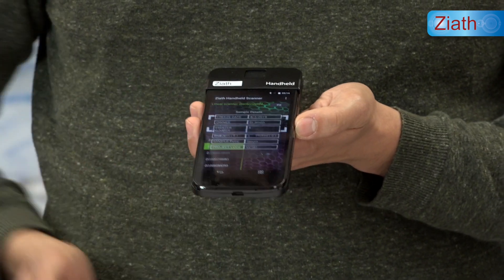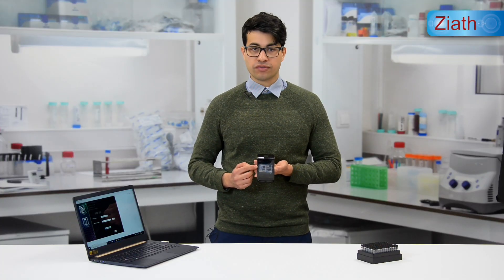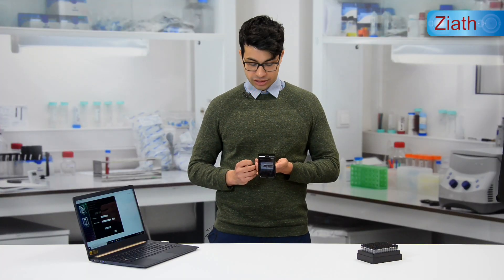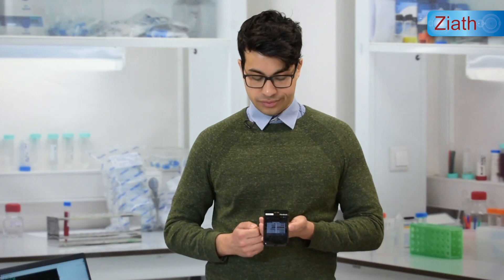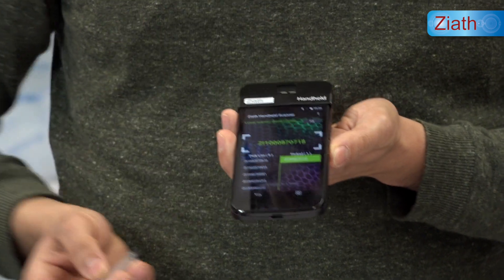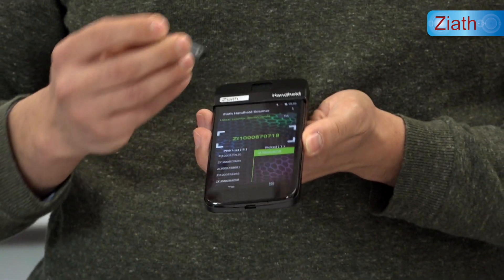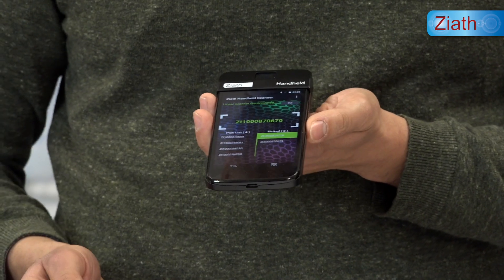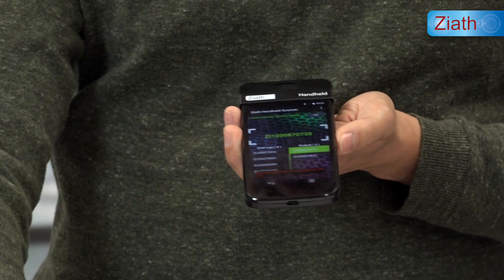If I click on another tube, the sample information is also displayed on screen. In the Excel file the location of the tube was also mentioned — for example, freezer number three and shelf two, which is completely customizable. We can take the handheld down to freezer three and find the tube on shelf two. We scan a tube by clicking the light up function button first. The tube will scan and move from the left hand side to the right to show it's been picked. If a tube is not contained in the list, it will show an error on screen informing you that the tube was not in the pick list.